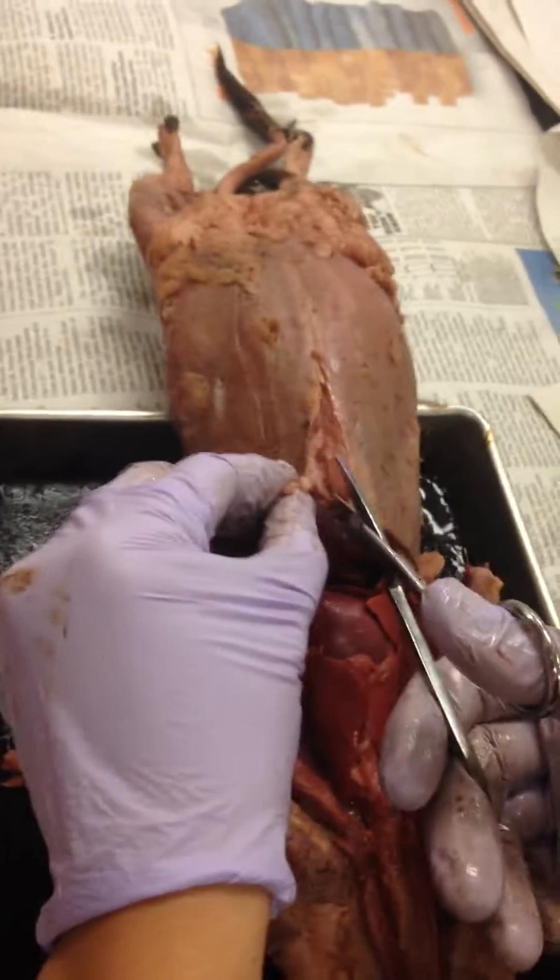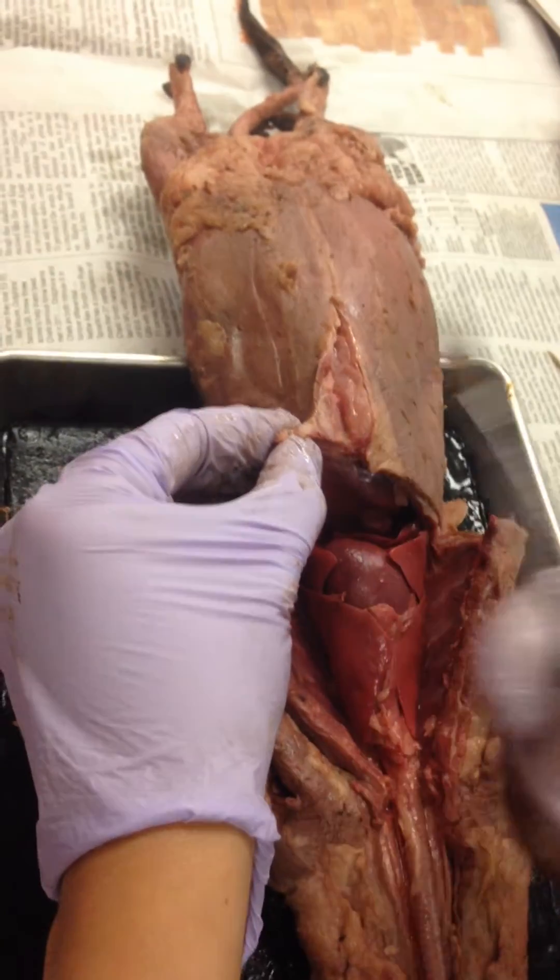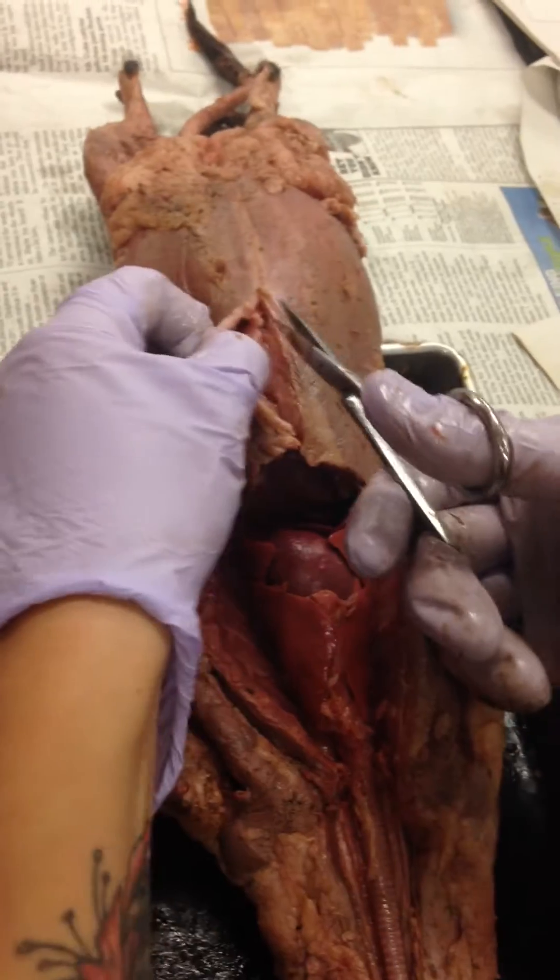Scalpels actually aren't quite as useful as scissors, because with scissors, since there are two blades, it's a lot easier to not go too deep.